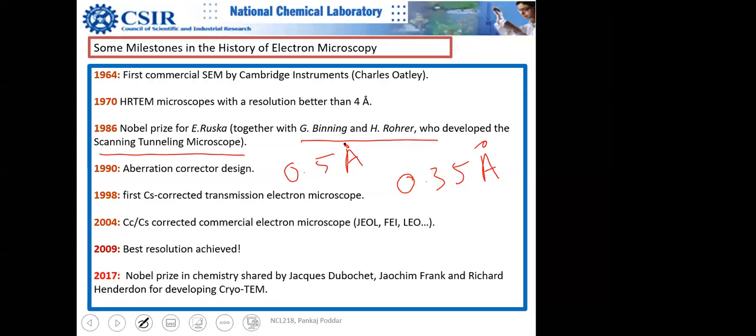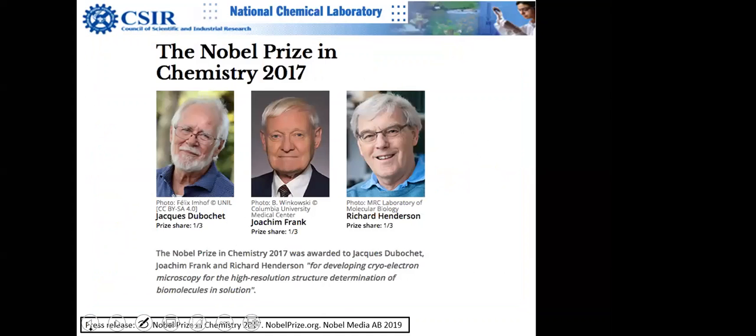And there are other problems also. I mean, that's not the problem, that you want to keep on increasing the resolution. But what are the bottlenecks in the resolution? The same terminology which we use in optical, geometric optics: aberration, actually spherical aberration and chromatic aberration. I will not be able to cover that part today because it's a very basic course.